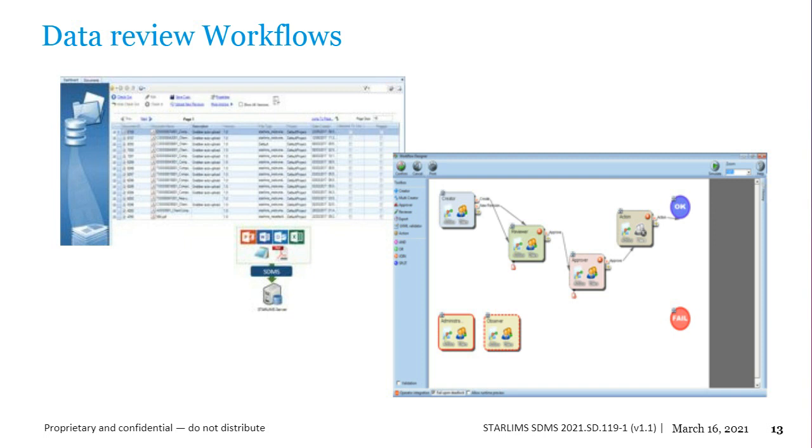So in this example, you can see the document is created in SDMS. It's followed by a review step, and then it's followed by an approval step. Eventually, that file content in the form of a UXML is then passed on to our events and triggers mechanism. And from there, you can push it to an external system. And it also can be retrieved using the APIs.